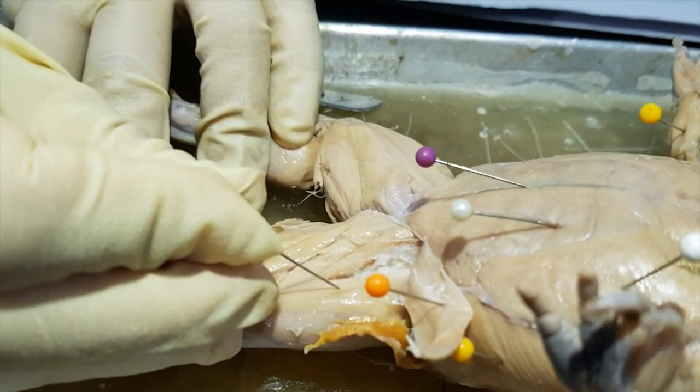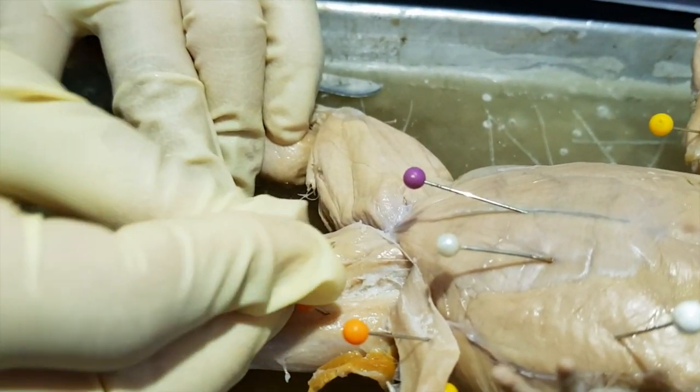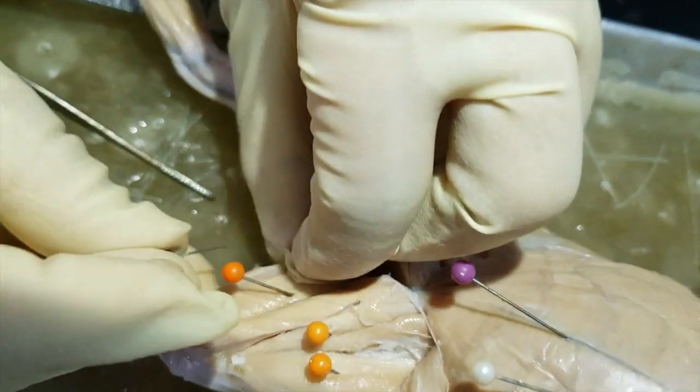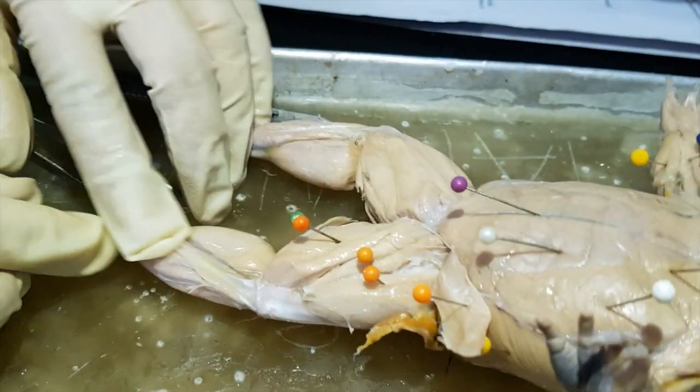So the adductor longus, adductor magnus, semimembranosus, and then the gracilis. Okay, muscle of the shank.